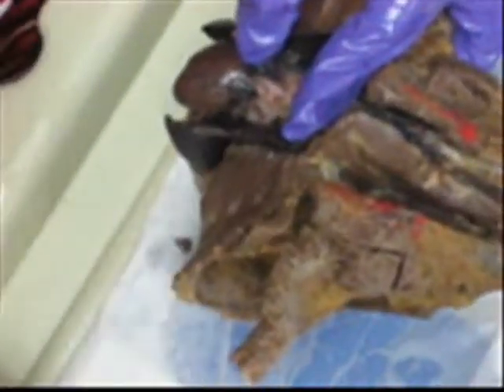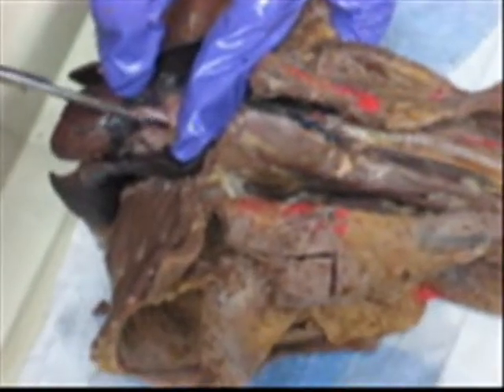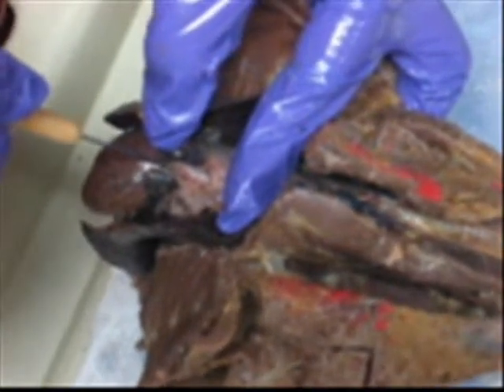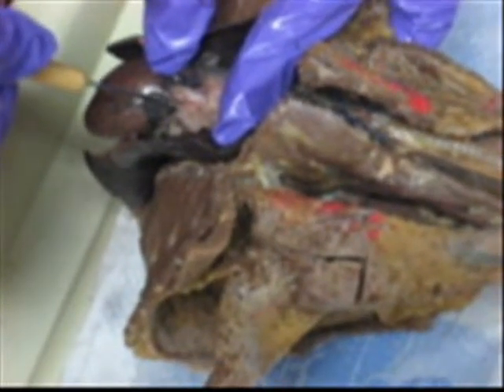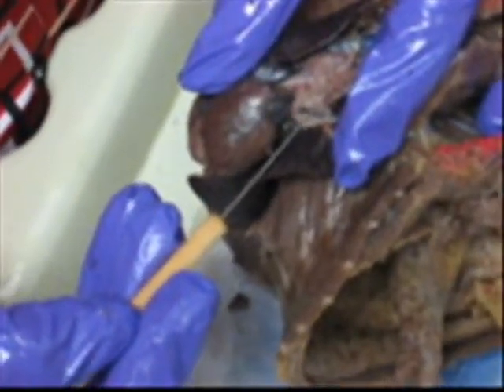Do you see it? It's branching off right here. Superior vena cava, ascending aorta, aortic arch, pulmonary trunk. And then over here — beautiful pulmonary vein.